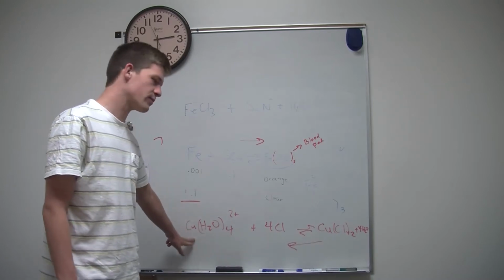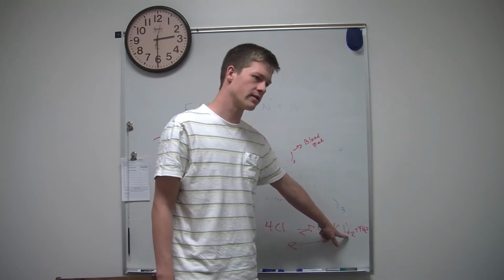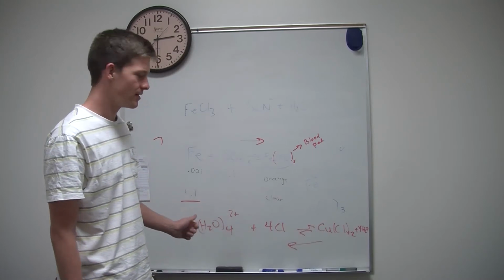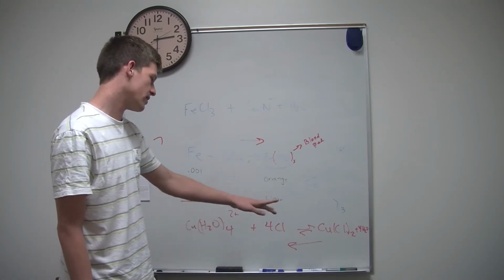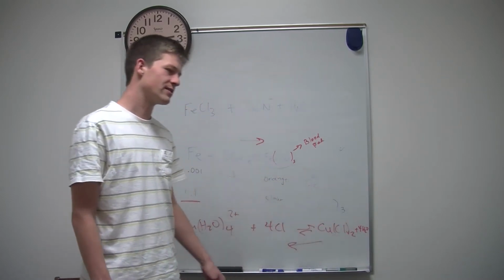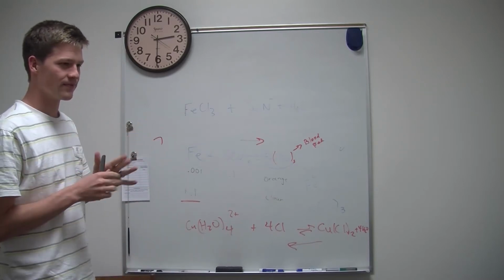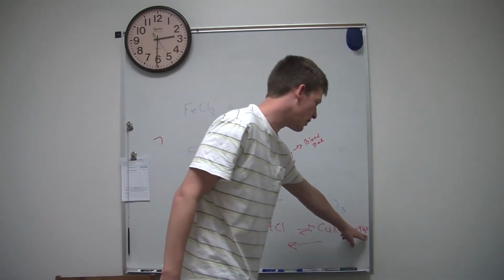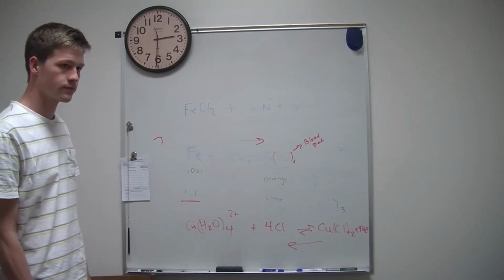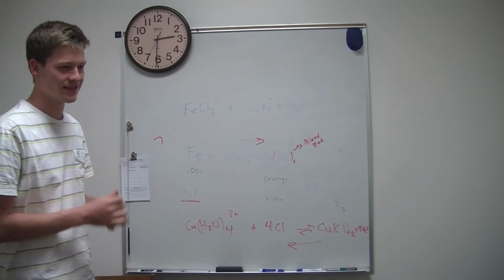Because this was blue, right? What you started with. And when you ran the experiment, it went green, right? Yeah. But you had more water, and it went back blue. If you look at this too, 1, 4, 5, that doesn't really help you with which one has more moles. For volume, right. But it does make sense that if we had water here, it would push this way. So it would shift to the left. Hopefully it was a faint blue color.